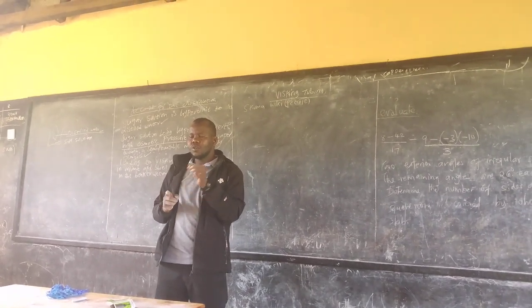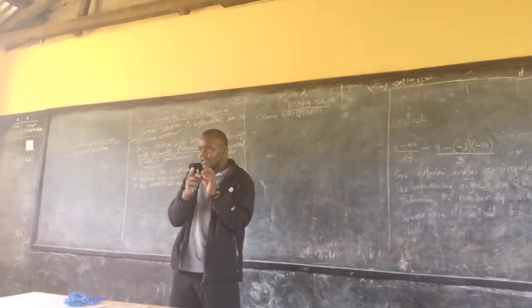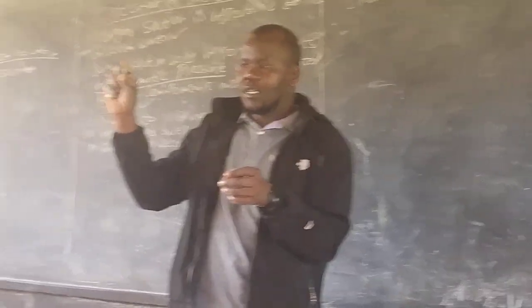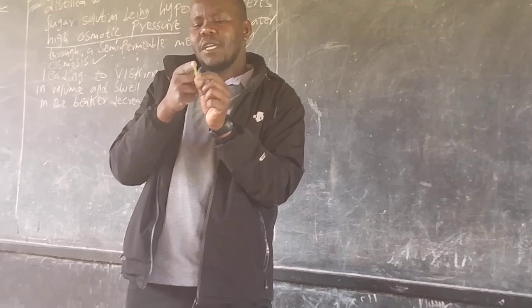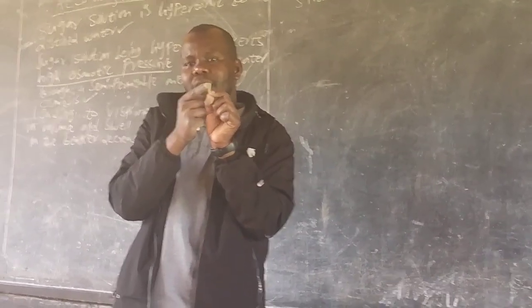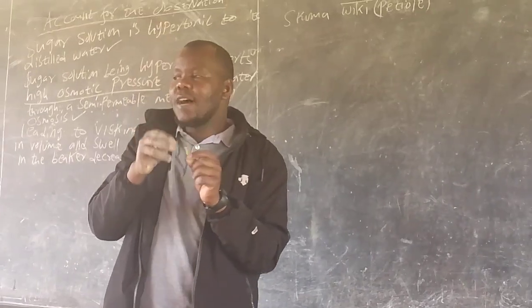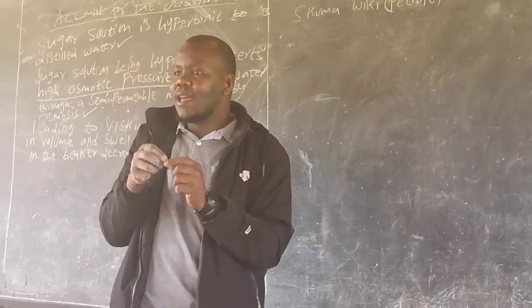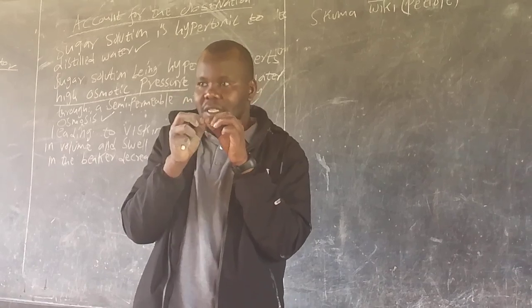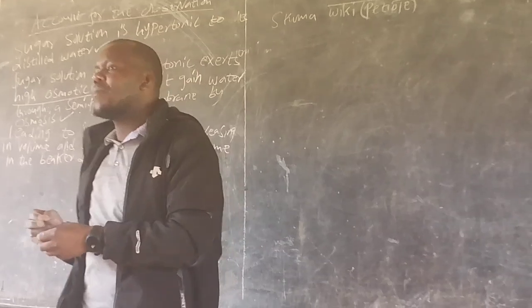So when you speak about the slits, that was KCSE last year. Let's say this one is 6 centimeters, and you are told to make a slit, cutting a section within the middle, halfway, to a 3 centimeter length. So you will have formed a split between these two, and with this split you make two: one to insert in distilled water, another one in a hypertonic solution.